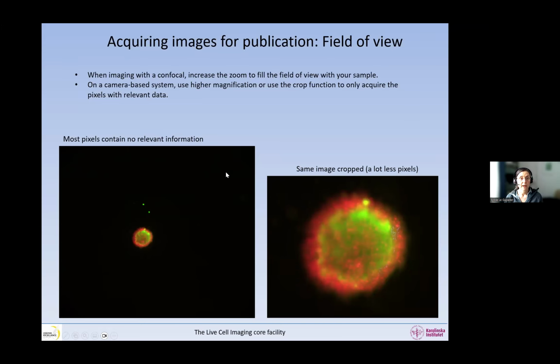And yeah, so basically, when you decide to crop or not to crop, you just need to think, is my action now going to change the interpretation of the image or not? If it changes the interpretation of the image, don't do it, okay? If it doesn't, so if I zoom in here or I don't zoom in here, and whether I see these two little things or not, it's likely not to change the interpretation of this area, so it's okay to do it, okay? Irrelevant information is removed in this image, but there's no change in the image interpretation if it's cropped, so then that's okay.